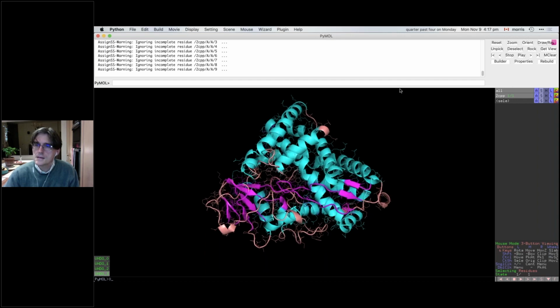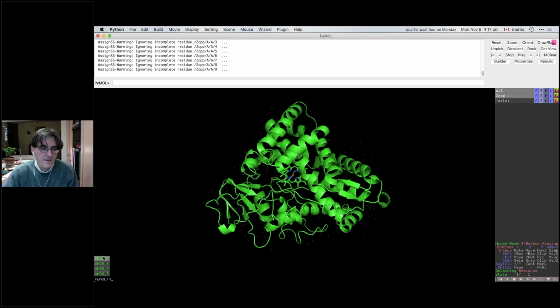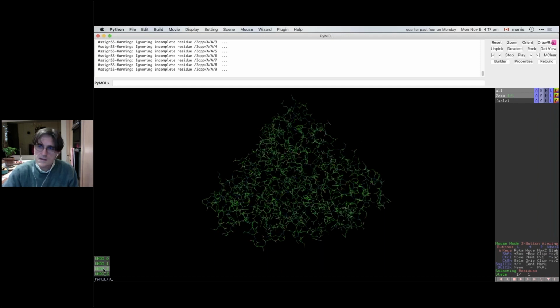Okay, so one thing that I should note is doing undos is quite tricky. It's not terribly good at doing undos, so I rarely use this simply because it doesn't seem to do very much. You can click at various states down here if you want, and you can restore the situation at various points through this undo stack that appears down here in the more recent versions.